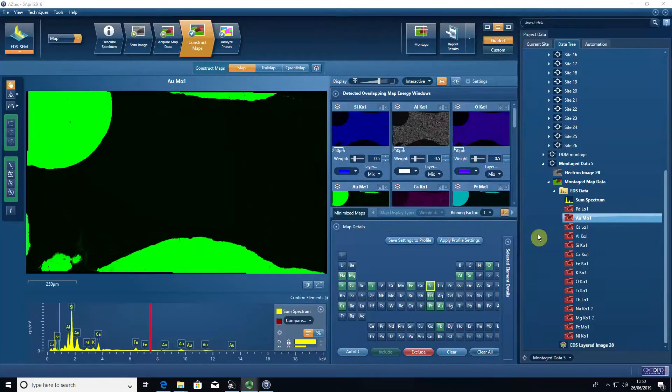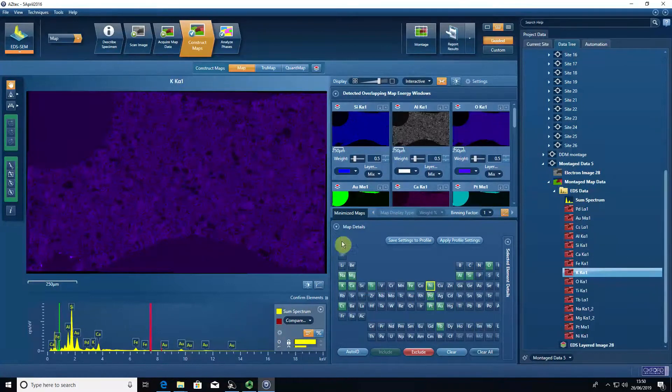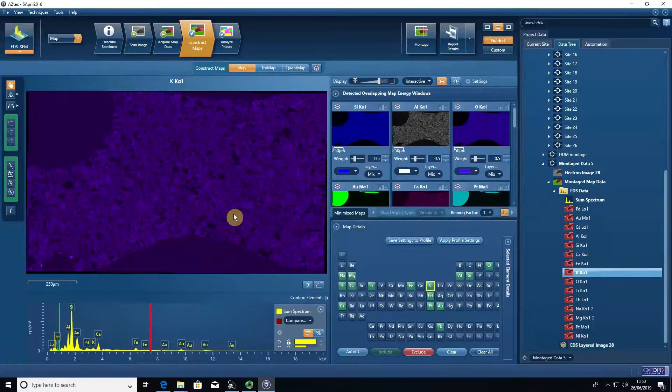Once you've montaged our element maps, we can then start to work on extracting the data that we really want from this element map data.